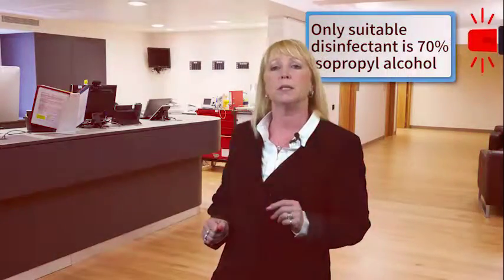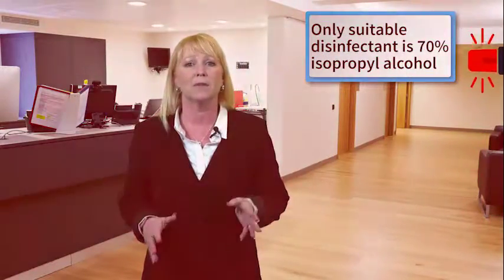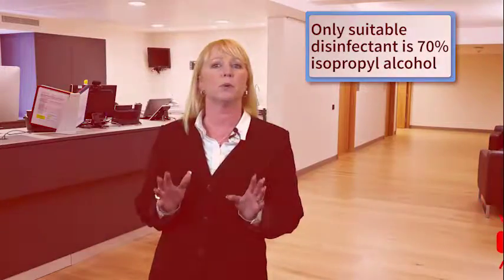The flow hoods and safety cabinets need to be cleaned inside and out. The only suitable disinfectant to clean this equipment is 70% isopropyl alcohol. Other antiseptic guidelines include never sneezing, coughing, or directly talking into a hood. So in order to keep you from doing that, it might be in your best interest to make sure that you have a face mask on when you are working with these particular pieces of equipment.